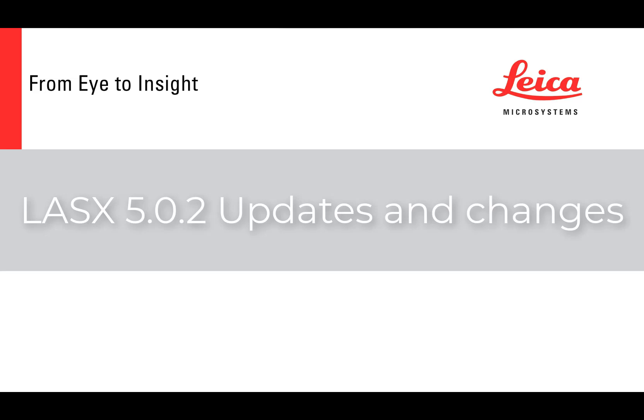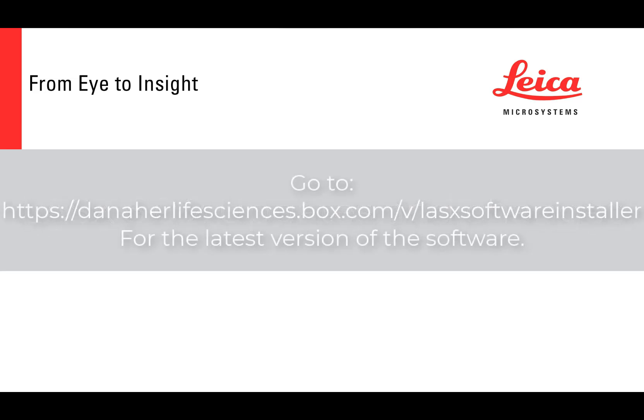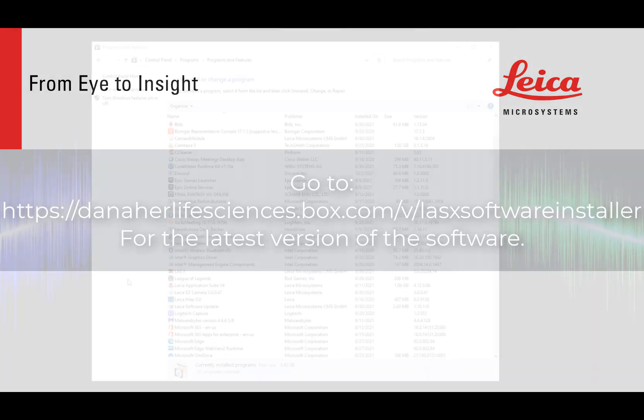Welcome to the industrial LASX tutorial video series. Today we will be talking about how to update and changes for LASX version 5.